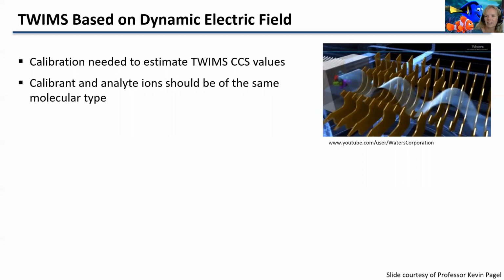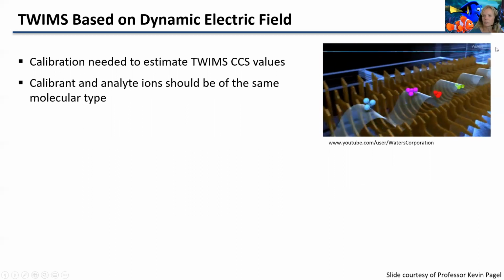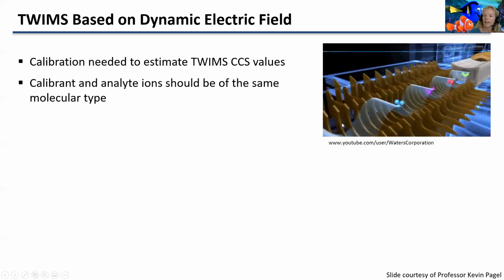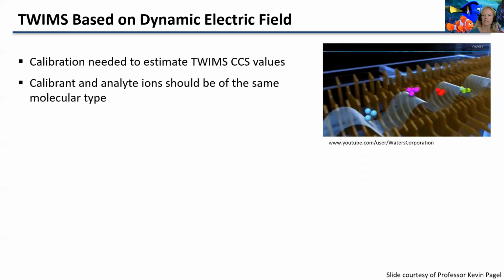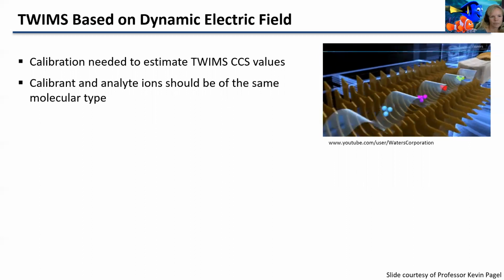And so for a nice little animation, Waters has this great one where we can see some molecules are pushed, like the green one, as it goes through, where other ones are bigger and they're going over each of the waves as it travels through the system. And that allows the molecules to separate into different regions of the waves.